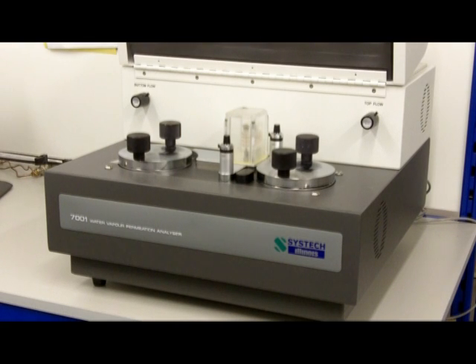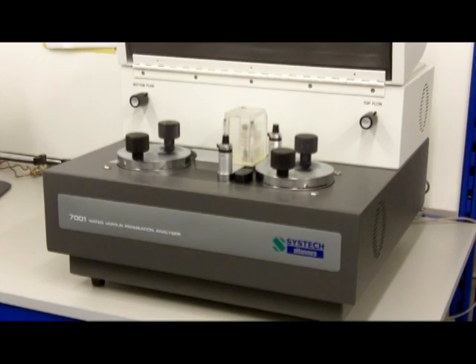It has wide temperature and relative humidity ranges and provides the widest measurement range on the market for a single instrument. You do not require any liquids, coolants or special gas mixtures to operate this analyzer.